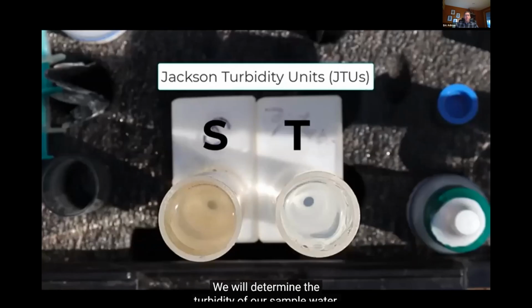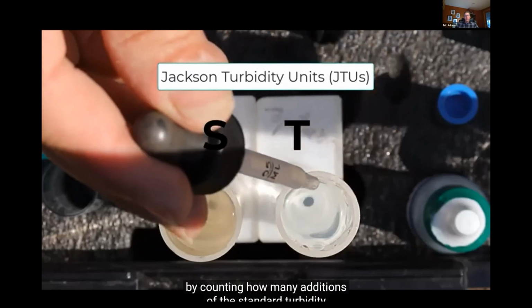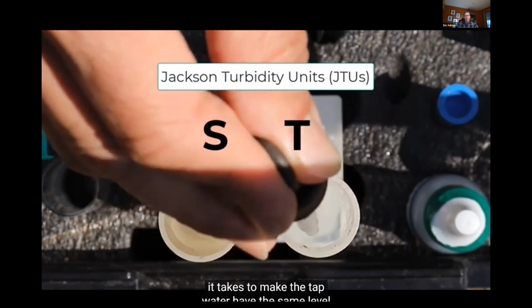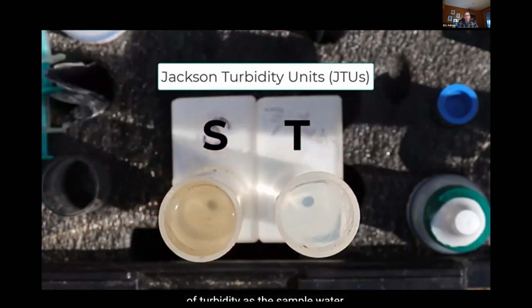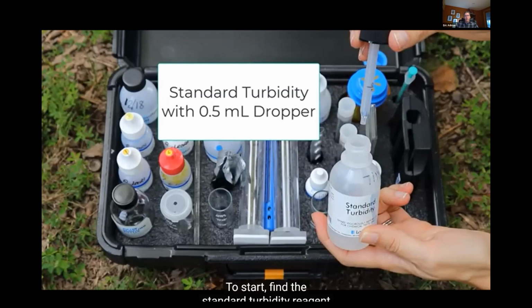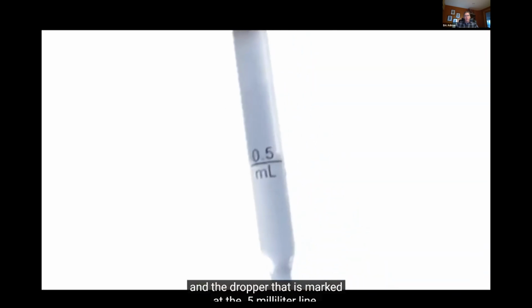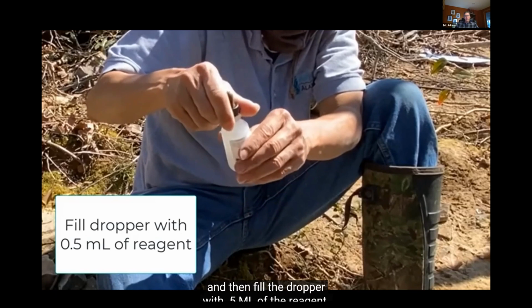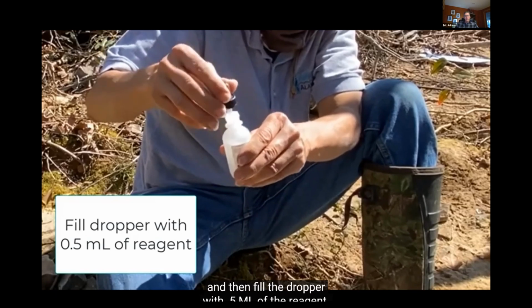We will determine the turbidity of our sample water in Jackson turbidity units by counting how many additions of standard turbidity it takes to make the tap water have the same level of turbidity as the sample water. To start, find the standard turbidity reagent and the dropper that is marked at the 0.5 milliliter line. Shake the reagent vigorously, and then fill the dropper with 0.5 ml of the reagent.